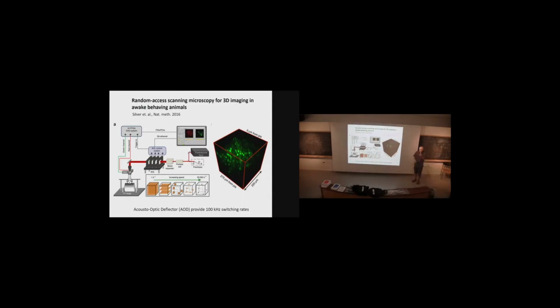Turns out you can sort of randomly point a laser using acousto-optic deflectors. Acousto-optic deflectors have no inertia. In fact, the limit to moving a laser beam around with steering mirrors or whatnot is the inertia of the mirrors. But with acousto-optic deflectors, there's no inertia. So potentially you can go quite fast. You can move the laser point and aim it randomly in your sample quite fast.